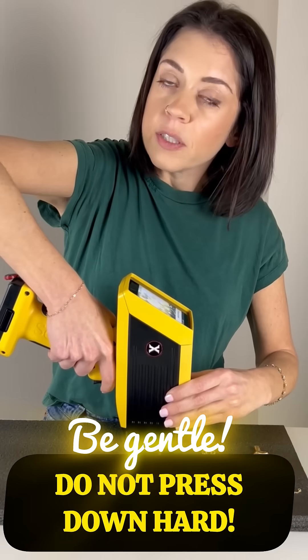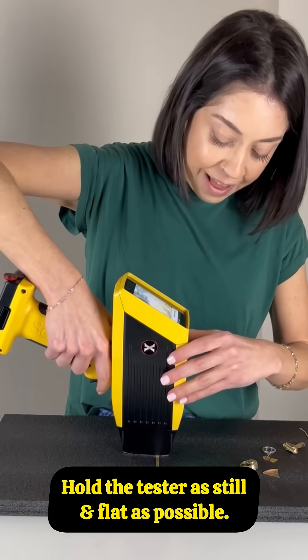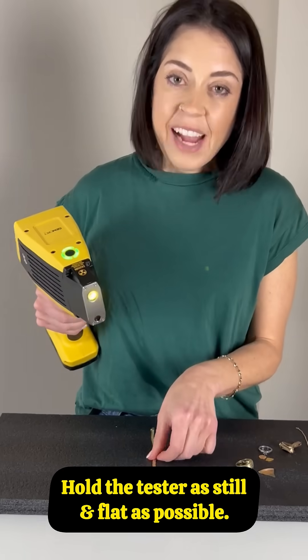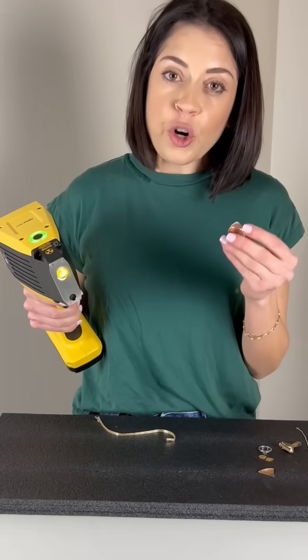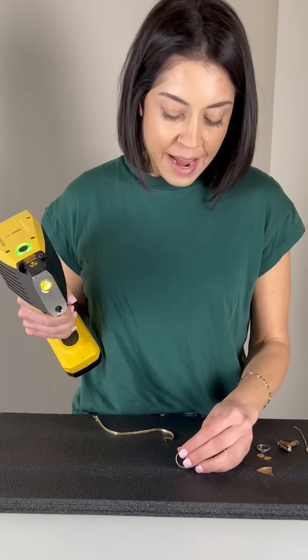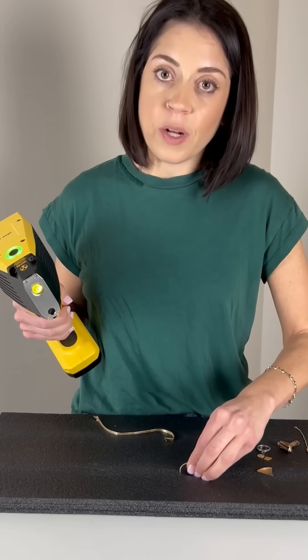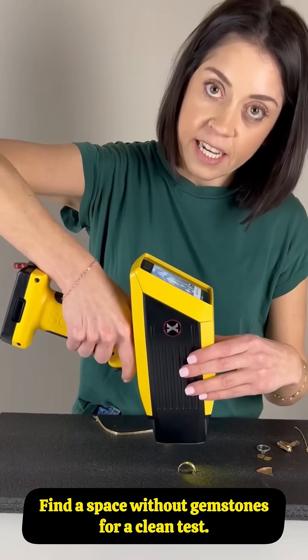Be gentle. Do not press down hard. Hold this tester as still and as flat as possible. Items like bracelets and necklaces are easy. For curved items like rings, it's best to create a divot in your mat so it stays put while testing. Find a space without gemstones for a clean test.